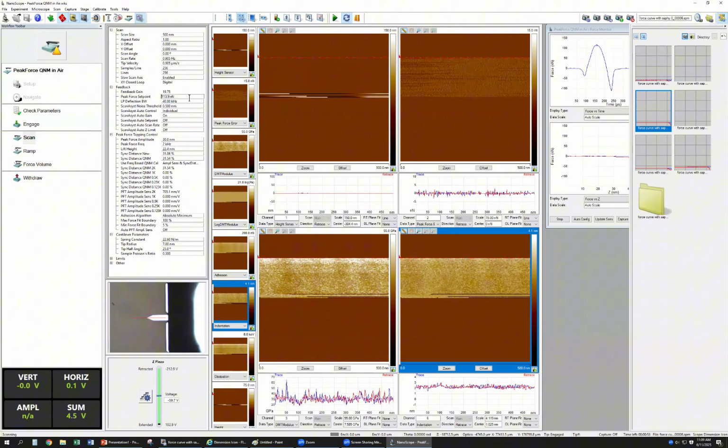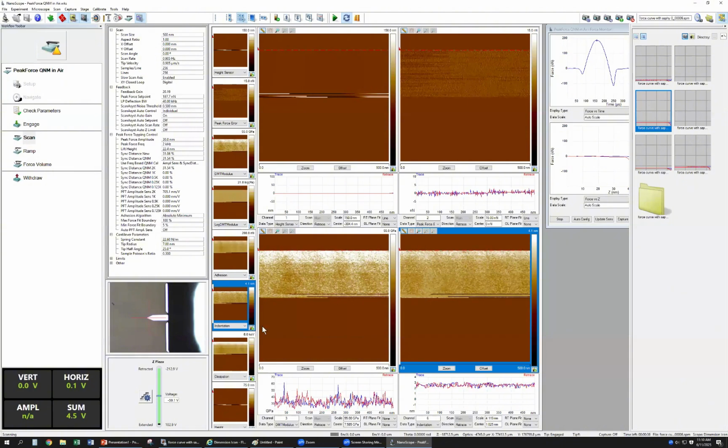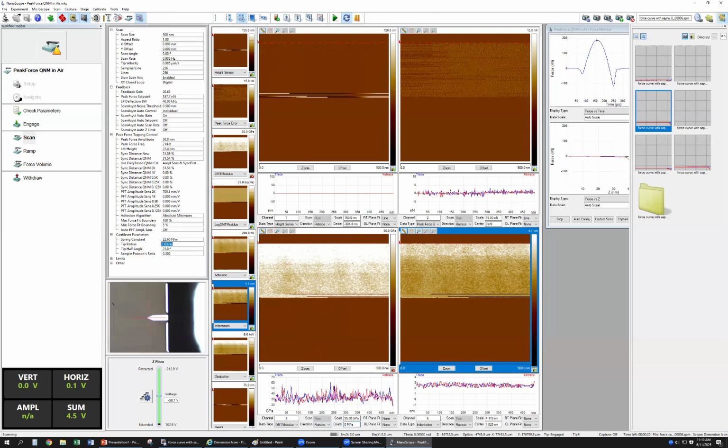Let's see. Okay, so if you get this one already bigger, now it's already 3 nanometers. Already got 3 nanometers. Then change this R value to make this one. For this sample, it's 2.7 giga, right? 2.7 giga. So we should change this one to make this value 2.7 giga.